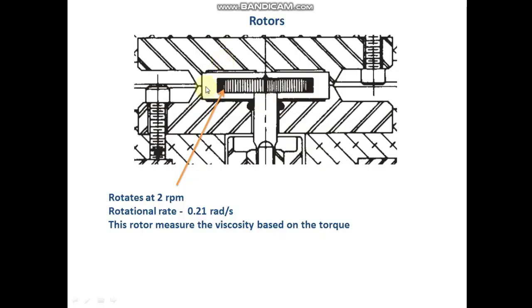Okay, so we have to fill our rubber sample into this cavity, and the rotor will rotate at 2 rpm rotational speed.